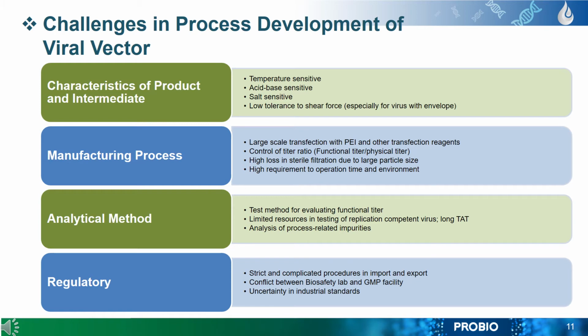Large-scale production using cGMP methods comes with a set of challenges that must be considered as more clinical trials using lentiviral vectors receive regulatory approval. One important consideration in designing a cGMP-compatible process is the need to have a manufacturing protocol that produces consistent lentivirus for multiple cGMP productions. During transient transfection, DNA must be mixed with a transfection reagent and then added to the bioreactor. Fluid dynamics in different bioreactor volumes are a concern, as there is a natural window of time in which mixing and subsequent addition to the cell should be achieved to maintain consistent transfection efficiency and production yield.